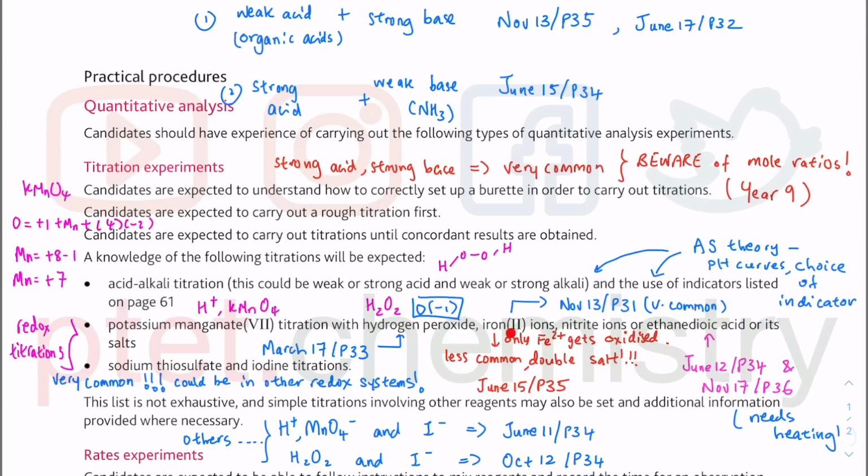The oxidation of iron(II) to iron(III) is very commonly done with acidified KMnO4 in the laboratory. The color of iron(II) in solution is kind of pale green. Solution, not the one with the hydroxide, but solution, kind of pale green, almost borderline colorless. So it's going to be dominated by the purple color of KMnO4. It will turn pale pink or colorless, and you stop your titration when one extra drop will not go away, giving you a permanent pale pink. Because if you get colorless still, how do you know this one has already fully reacted? You stop when you get a permanent pale pink with one extra drop when you're titrating with iron(II).